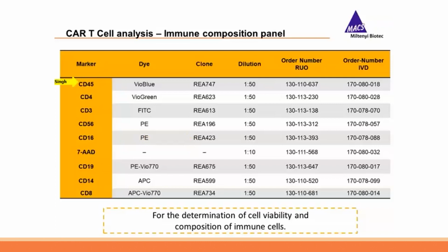Just to indicate how one can identify that we are working with a recombinant antibody: the REAfinity clones are indicated as REA clones followed by numbers.